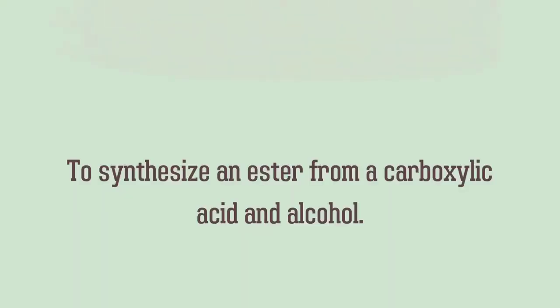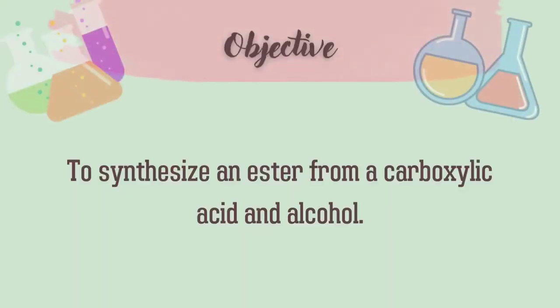So here we would like to conduct the experiment about esterification. Check it out. Let's go. So the purpose in this experiment is to synthesize an ester from a carboxylic acid and alcohol.